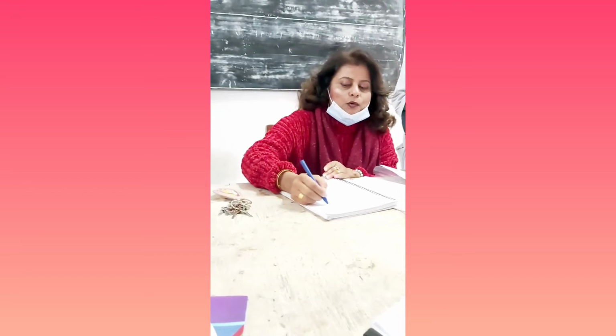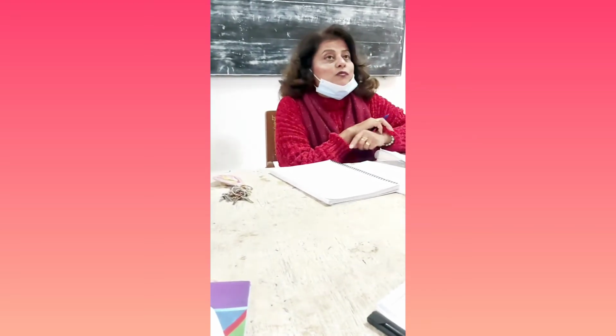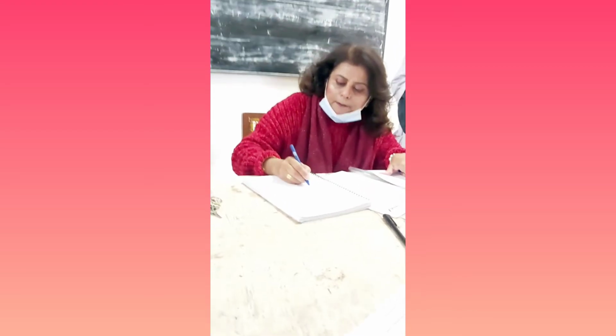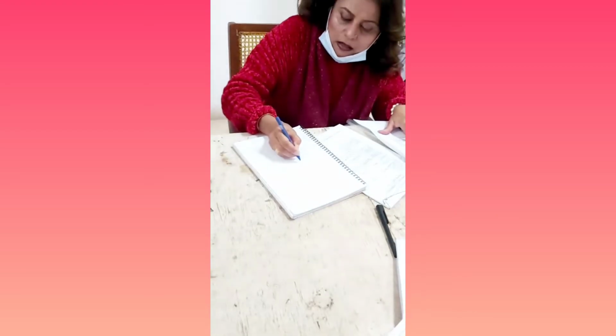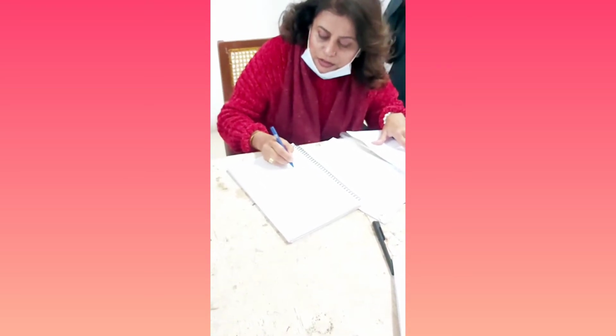So when it's in the kerosene oil, you are going to cut down a little piece, and you are going to dry it between the folds of the filter paper. Just take two filter papers and dry in between the folds, right? So this is what they mean. Dry the piece of sodium metal between the folds of the filter paper. Introduce this sodium metal into an ignition tube. Now this is an ignition tube. So now you have this metal, you're going to introduce it, and it should go lower down and touch the bottom. It should be of this much size that it should go inside that ignition tube, right?